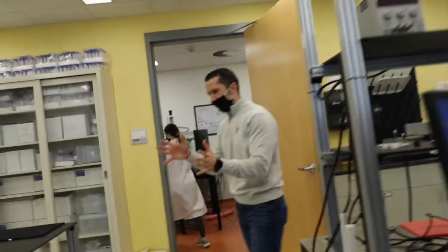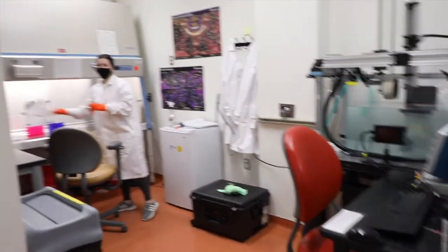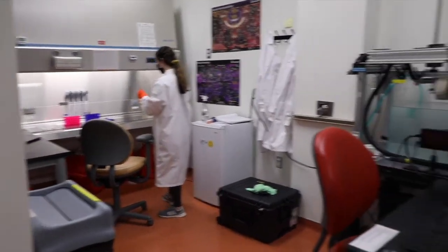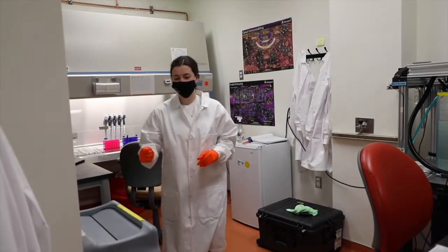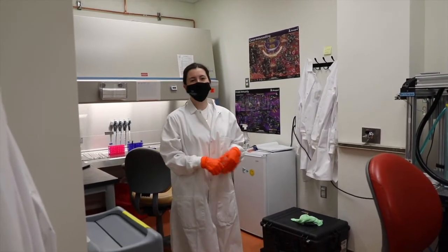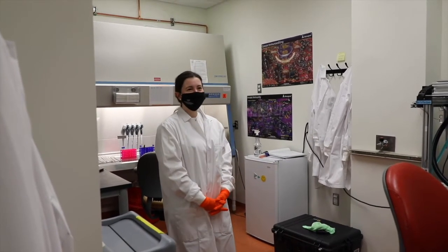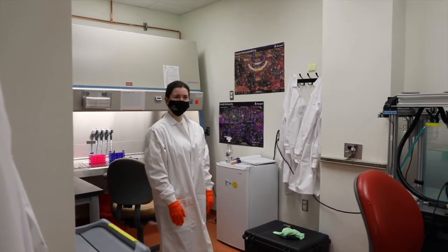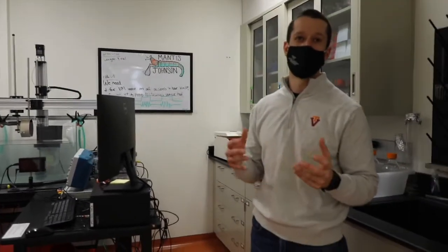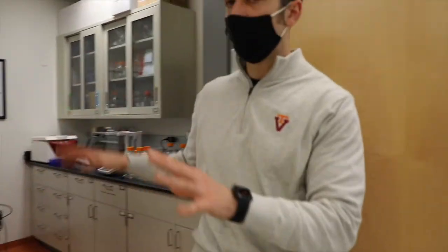And so then we have kind of separate little stations here, and then if we go in here, this is our cell culture hood. We won't interrupt Maggie as she's doing experiments here. Maggie has worked in the lab as an undergraduate student for what, 3 years now? Yeah, coming up on 2 years, I think. Okay. I started in the summer of 2018. Okay, great. Undergraduate student, yeah. And she's graduating this year and, sadly, leaving the lab and going on to bigger and better things. But she's working on a project to develop nanoparticle-guided histotripsy for the treatment of metastatic breast cancer right now. So this is more of our sterile cell culture facilities here.